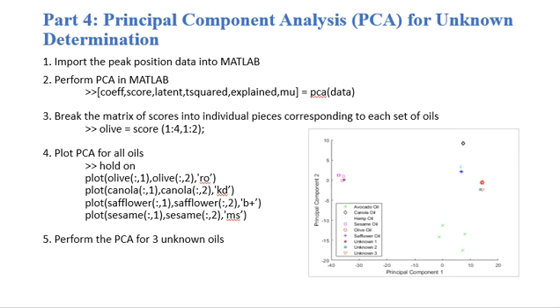You can tell which unknown oil belongs to which known oil by seeing which cluster of oil data points they go with.